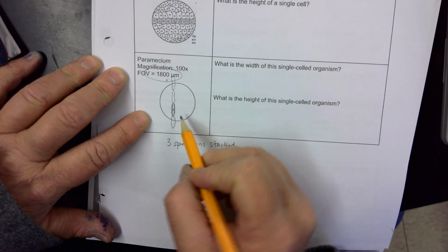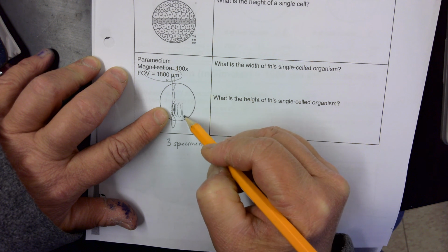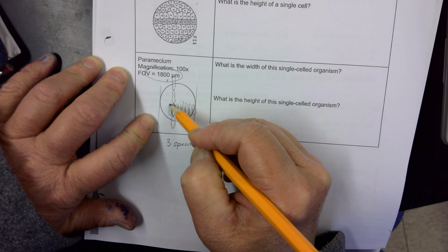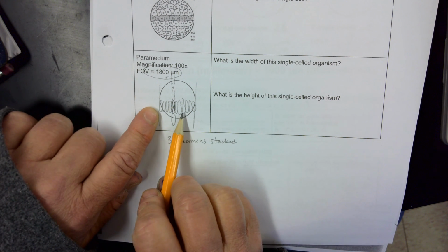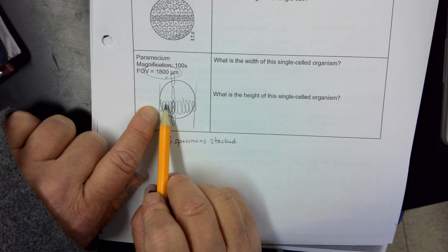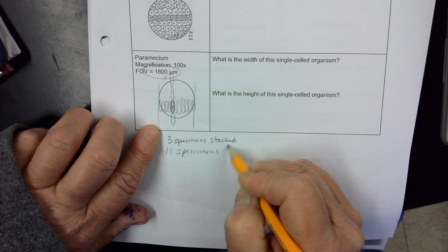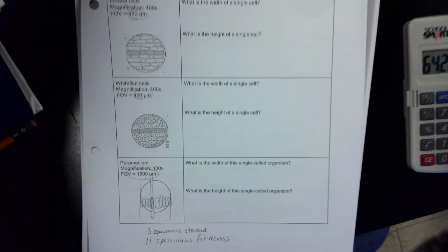And then same thing going the other direction. If we're trying to figure out the width, you know, just kind of sketch how many of these could fit across. And I'm going to extend it out past my field of view because remember you're trying to figure out going out to the diameter. And this is also an estimate, right? So you're just trying to give yourself a little help in estimating how many can fit across. So I would say 1, 2, 3, 4, 5, 6, 7, 8, 9, 10, 11. I would say 11 specimens can fit across. So that should help you try the problems that are on this last page.